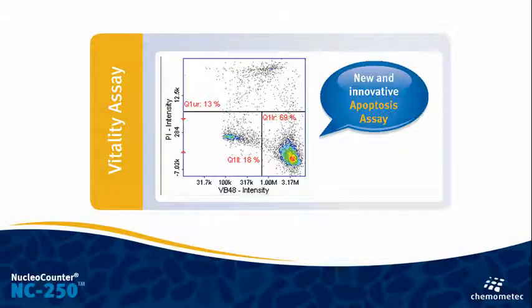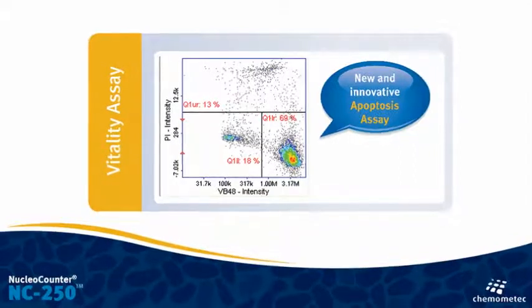The Nuclear Counter NC250 also offers the world's fastest apoptosis assay. Just add Solution 6 to your cell sample, load the slide and press run.